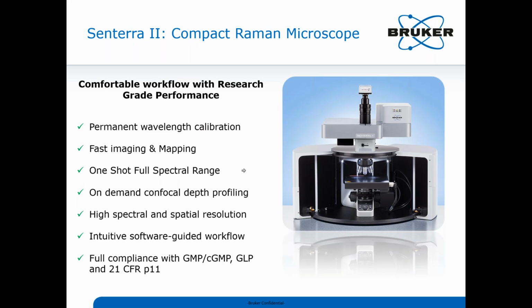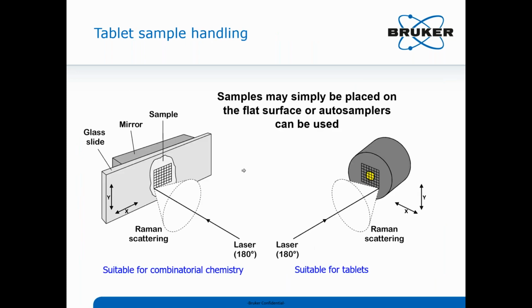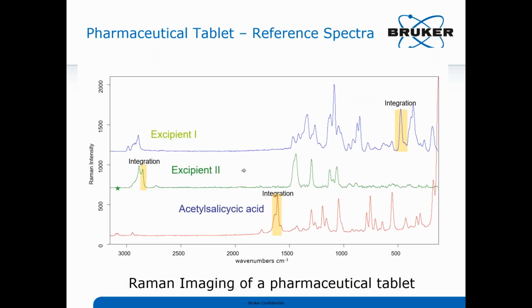For the Raman now, it's the same type of thing. We're going to use one shot to cover the full range, which is important, and you do the fast imaging. This is a fun example where we're looking at tablets. So we're actually going to go now, instead of filling the full field like we did for the IR, where we're going to illuminate the whole area. In Raman, if you filled the full area rather than going point by point, you actually would be defeating the Raman effect, because the laser power is so important for getting a Raman signal. If you diffuse that power by an area function, you lose power by squared. So in Raman, unlike the IR, we don't want to fill the full field, and we'll do them point by point fast.